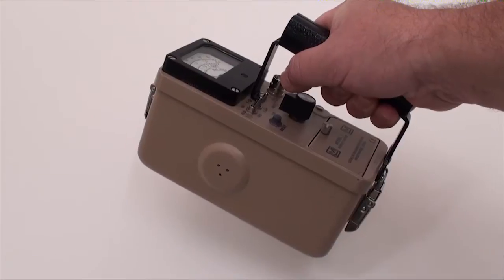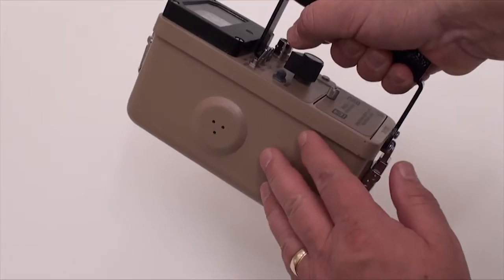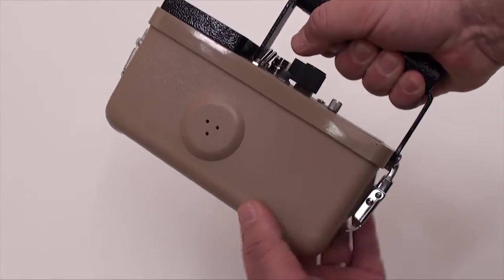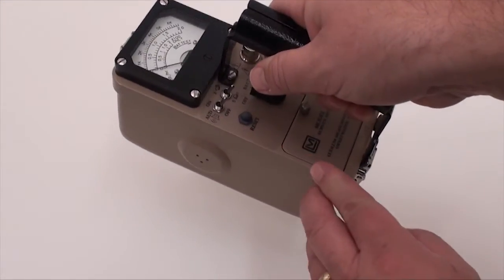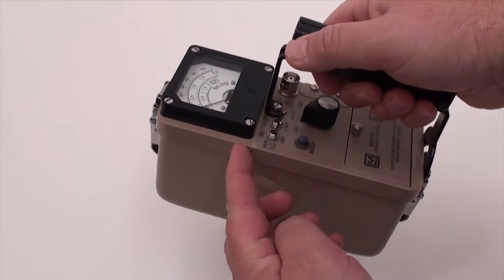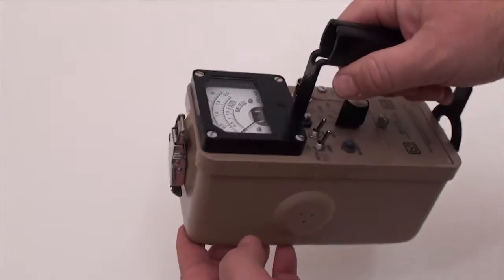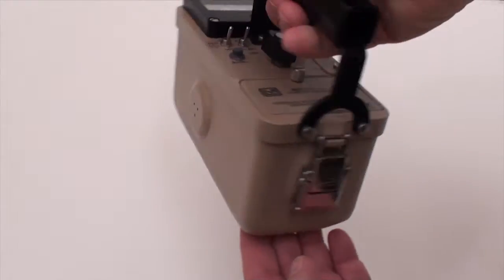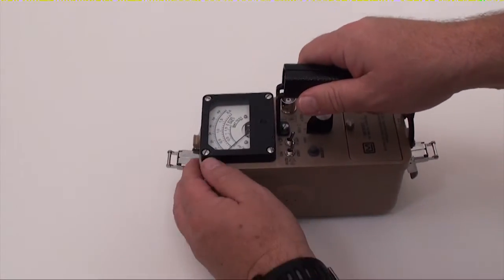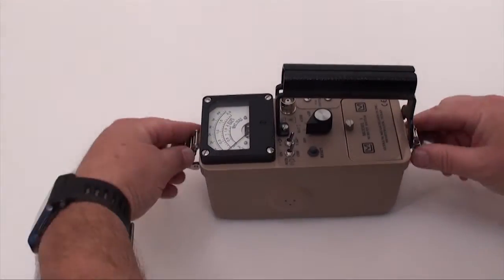These high value features are built into the instrument and begin with its rugged metal construction consisting of a drawn aluminum bottom can that is mated to a cast aluminum top plate where all the controls are located. The top plate is fastened to the can with two stainless steel latches that facilitate easy access to the internal electronics.